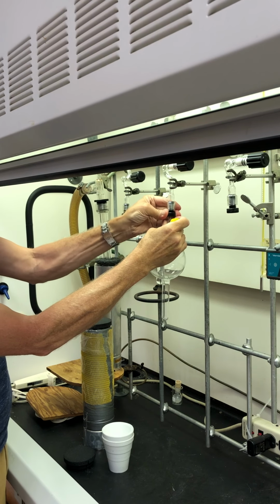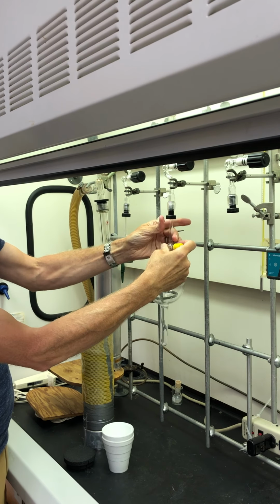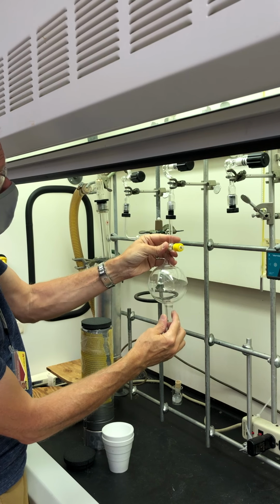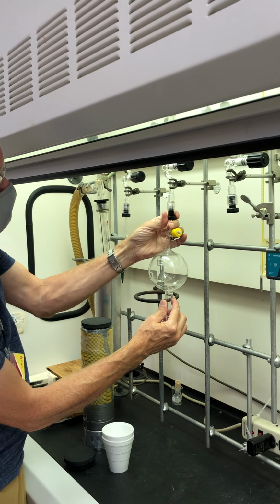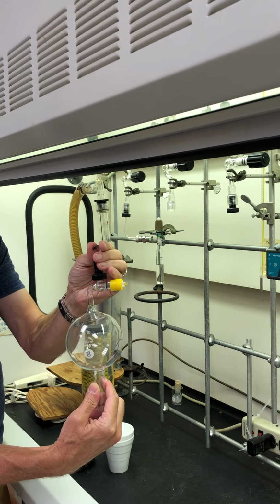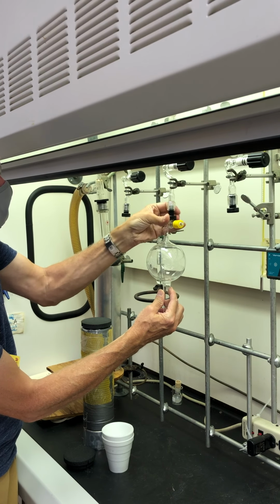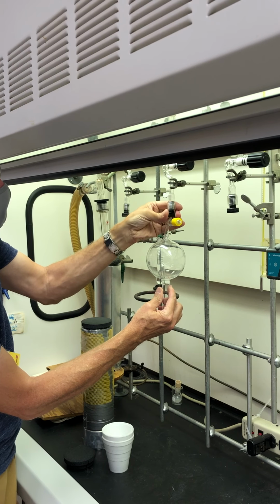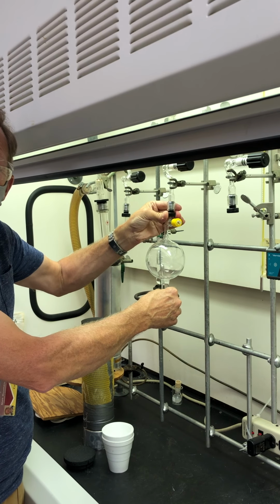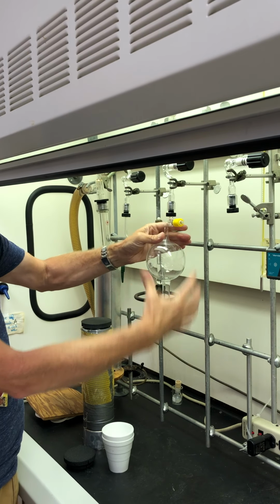That's done by loosening this fitting and then just sliding this out. And so then this bulb is what can be measured over on the balance. Then to bring it back, we run it back in here. We have to make sure the O-ring will go around the glass tube. So here's this O-ring. I slide it on and put it back in. Once that is feeling the pressure of going against the O-ring, just a little more of a twist. It doesn't have to be really hard. That's a good seal. That will hold the bulb on, it won't fall.